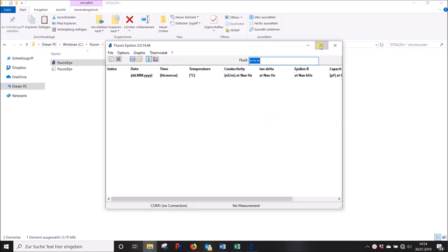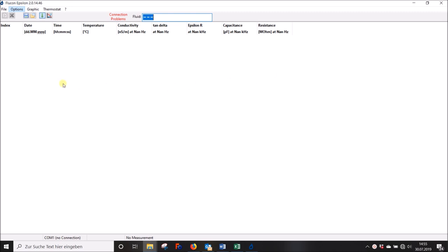It wants you to configure the correct serial port for your Epsilon Plus device. To select the respective COM port, simply click on Options, then Serial Port. To select your COM port, use the device manager if you are unaware of the correct port number.